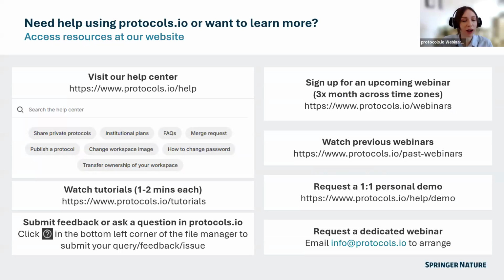All right, so it's hard to cover all of the things that protocols.io can do in one webinar. I know we covered a lot of information today, but if you do want to learn more, we have a lot of resources that can be accessed. First of all, I encourage you to visit our help center, which can be reached at this link. We also have short 1 to 2 minute tutorials on how to do different things on protocols.io. For example, we have a tutorial on how to import a protocol using the AI importer. So I'd encourage you to check these resources out if you want self-service help.